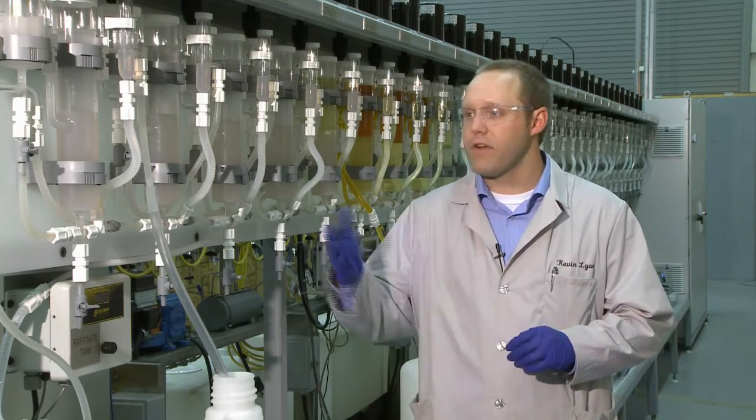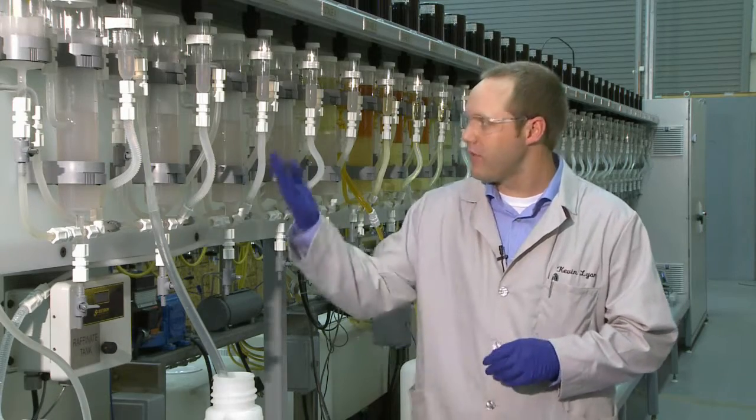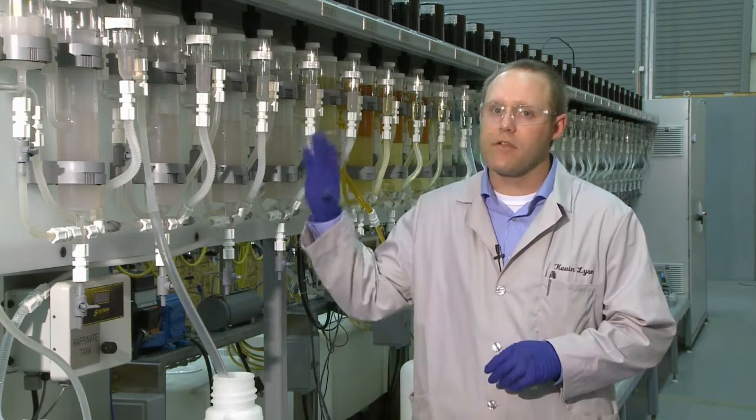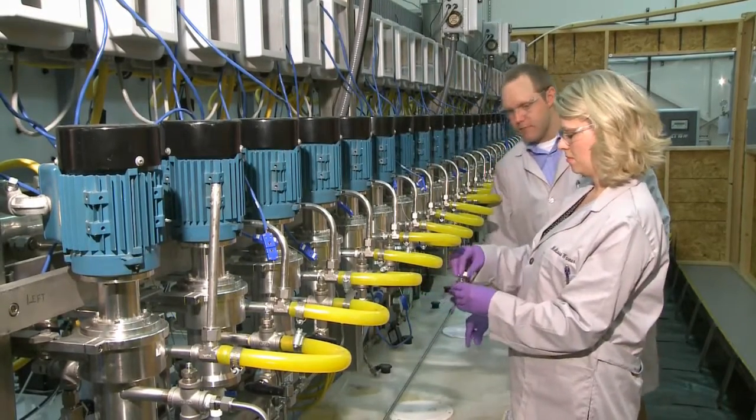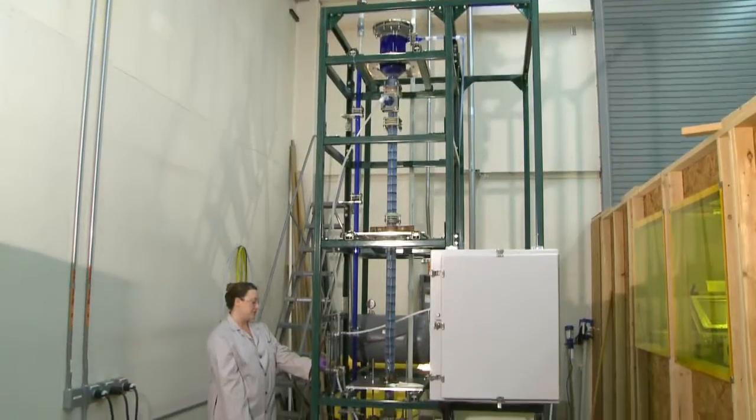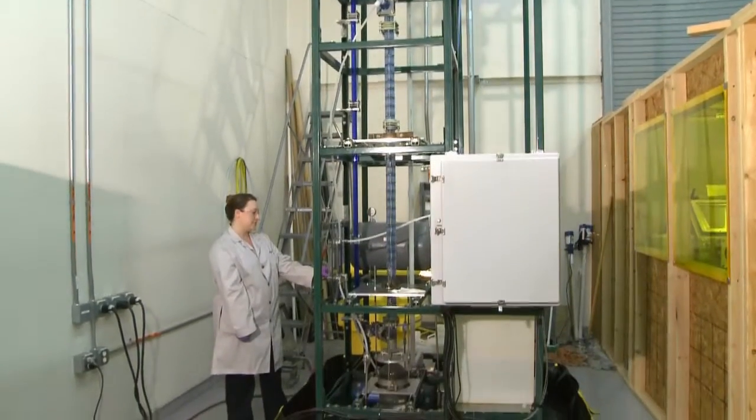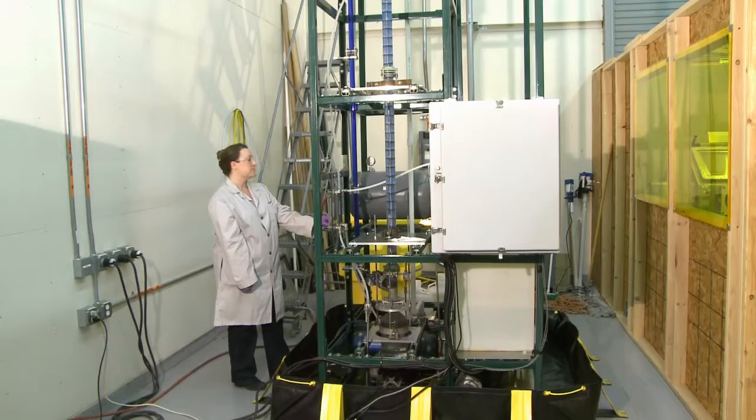INL has a lot of really unique capabilities here at the laboratory for solvent extraction testing. We have, as you can see here, a 30-stage glass mixer settler system for the Critical Materials Institute. We also have a centrifugal contactor pilot plant, pulse columns, and various laboratory equipment for testing and developing processes for solvent extraction systems.